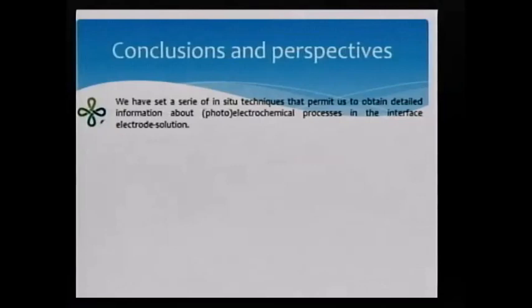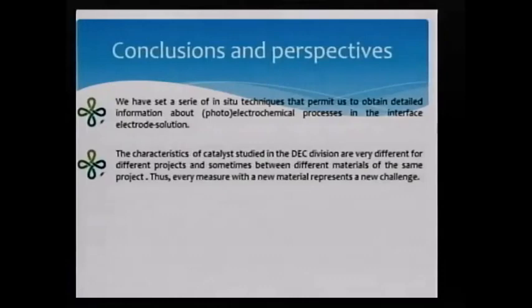The characteristics of the catalysts we are studying are very different. The catalysts that Claudia prepared are completely different from the catalysts that Anna prepared. I'm not talking only about the physicochemical parameters, but if you look at the catalysts, they are very different. And that is important, for example, for techniques where you need a beam to heat the catalyst and reflect. So several times we need to adapt the techniques for the different materials.